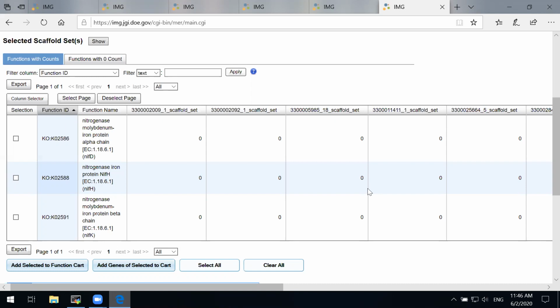Why would that be? Well, first of all, plasmids often have different oligonucleotide composition from the chromosome. In many cases, plasmids have lower GC content than the chromosomes of the genome. So they won't look like the chromosome of the genome. On the other hand, plasmids are often present in more copies than the chromosome. So this will fail the second criterion used for binning, the read depth or coverage, because again, for the binning tool that we are using, the plasmid will look different from the chromosome of the genome.